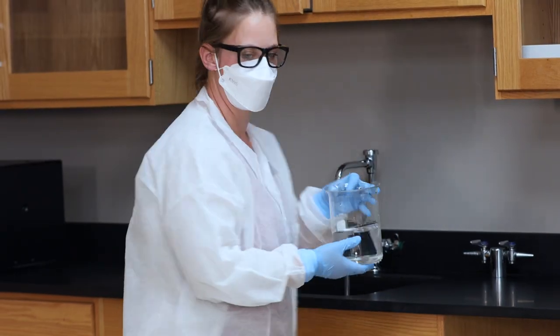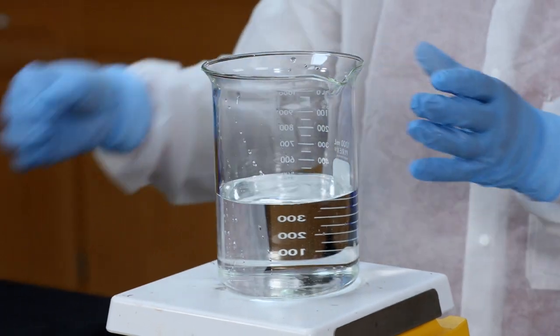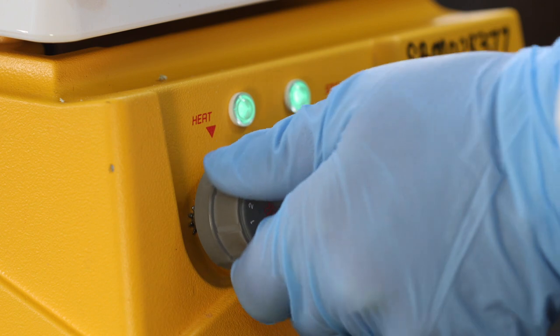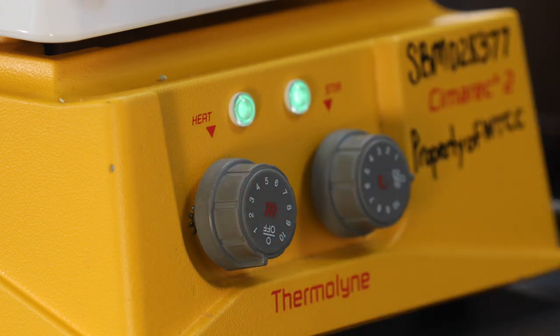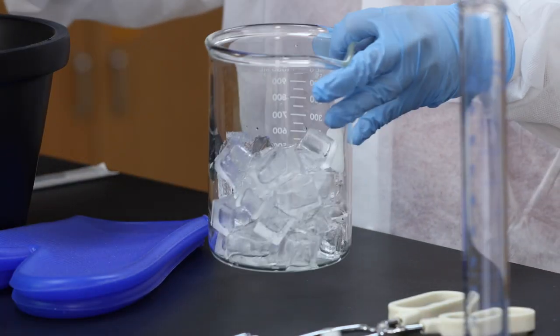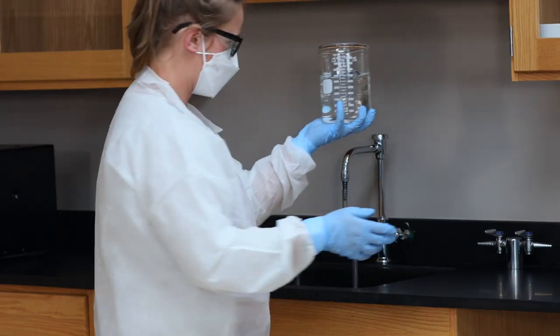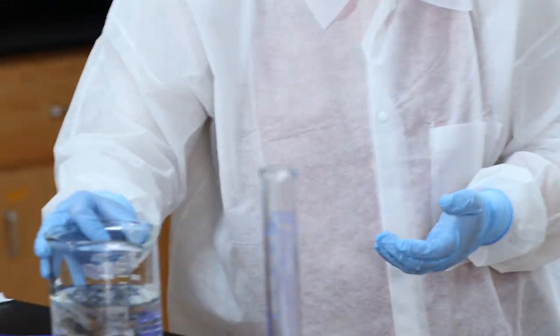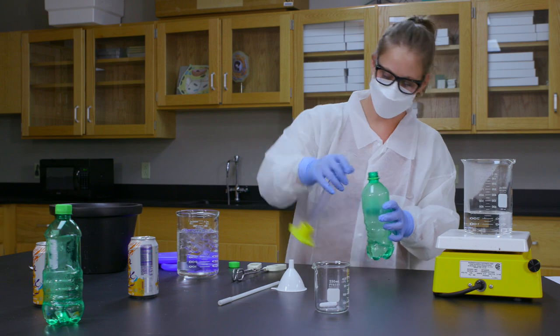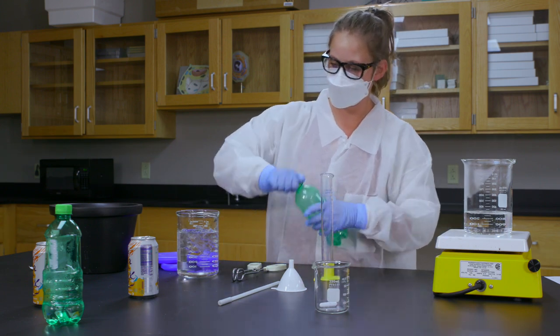Let's go to the lab. Add about 500 milliliters of water to a 1000 milliliter Pyrex beaker, place a stir bar in the beaker, and set it on the hot plate. Turn up the hot plate temperature control until the water comes to a rolling boil. While we're waiting, fill a bucket about one-third of the way with ice and add enough water to completely cover the ice.